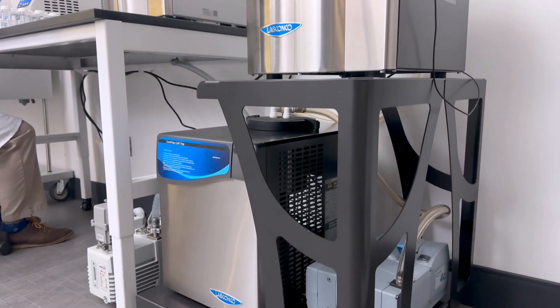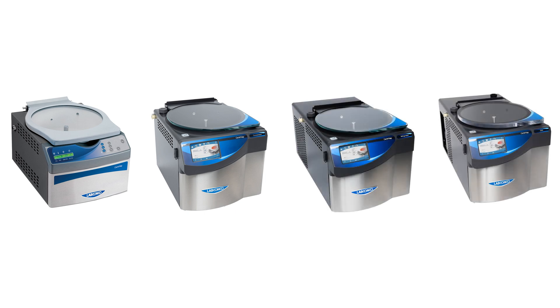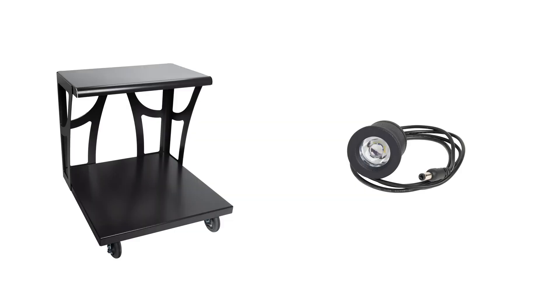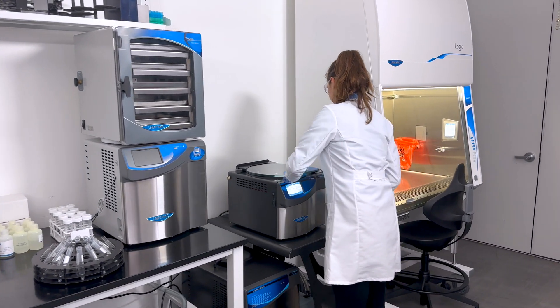The all-new Centrivap lineup features standard, acid-resistant, refrigerated, and all-in-one models, as well as a wide range of compatible sample rotors, cold traps, and accessories tailored to your unique sample processing needs. Transform your laboratory workflow with the Centrivap Pro centrifugal concentrator.